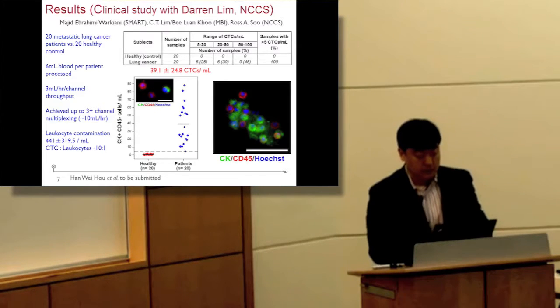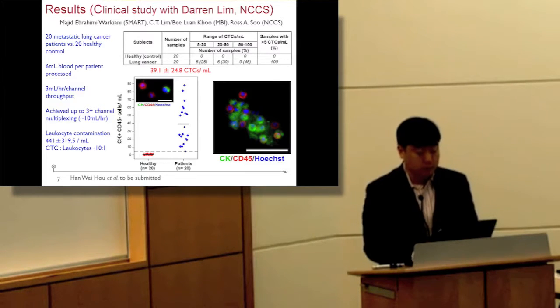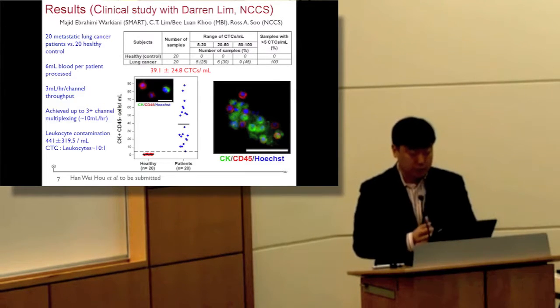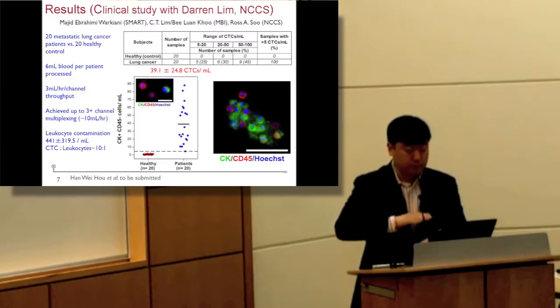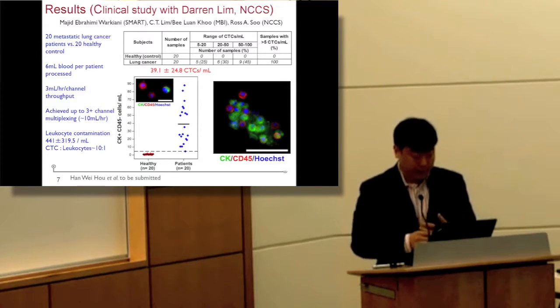And the throughput is relatively high. A single channel can process up to 3 milliliters per hour. And if we stack multiple channels, we can achieve 10 mL per hour. So it's pretty fast.